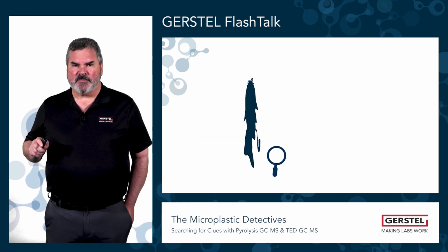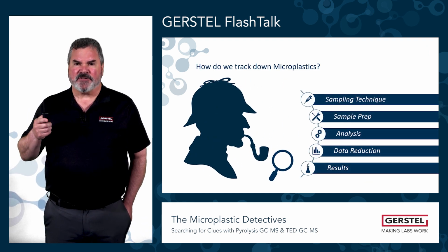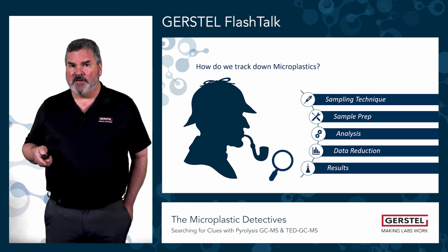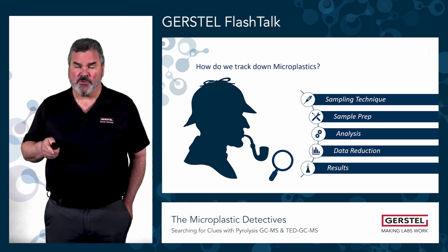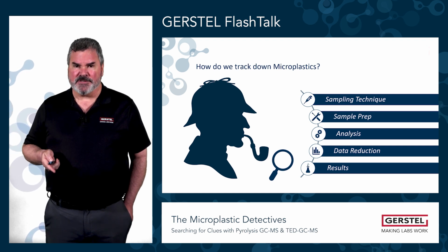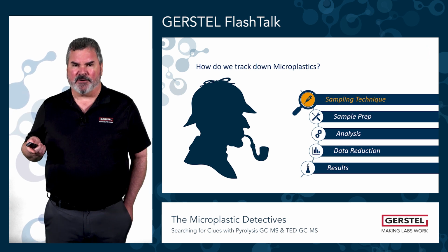But in general, no matter which technique you use, the overall process is the same. We have to take a sample, we have to prepare the sample, analyze the sample. We get a lot of data out of microplastics, as you'll see later. We need to reduce that data down into something that gives us results quickly. So no matter which way you go about this, your workflow is largely the same. So let's start with sampling first. What does sampling look like for microplastics in water?